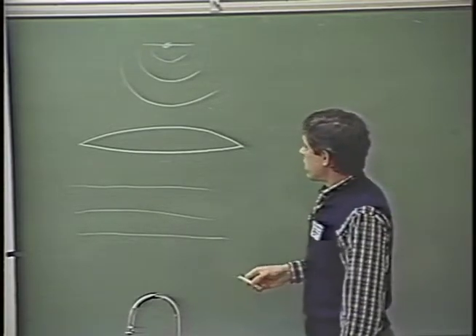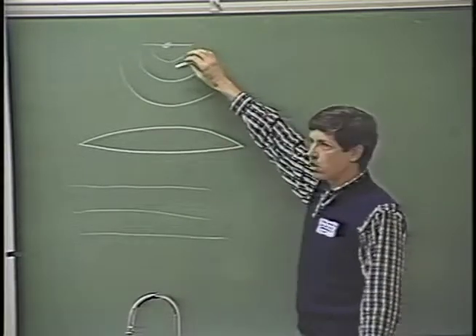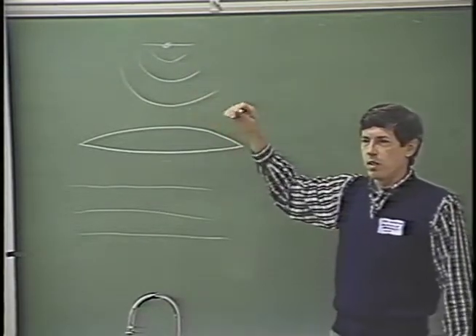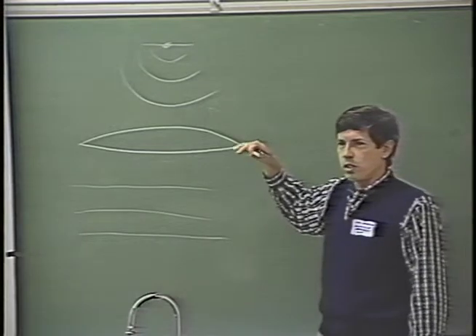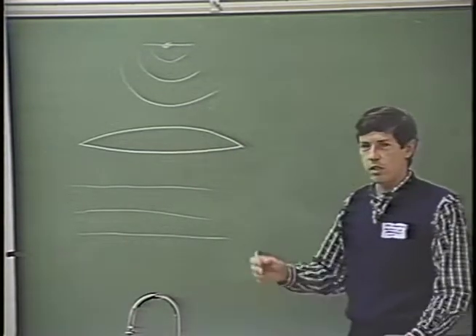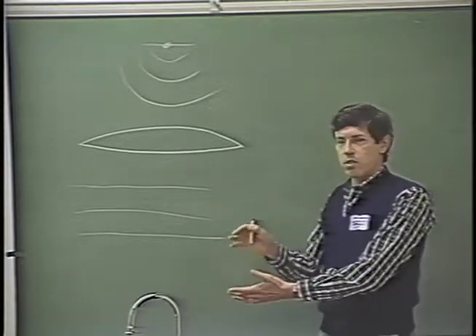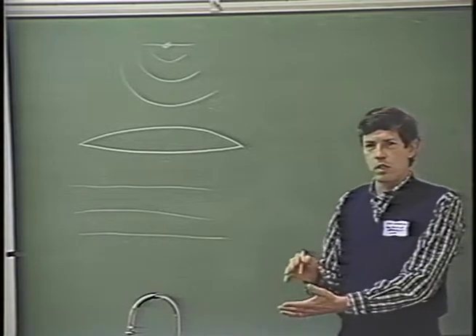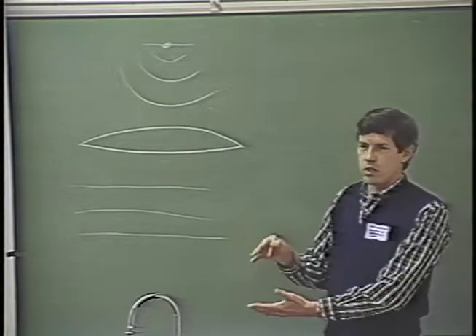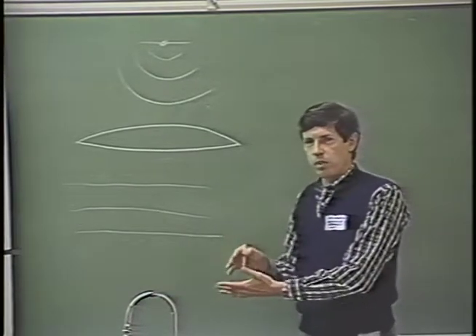Now the reason that happens has to do with the fact that these scattered waves are shifted in phase by a quarter wavelength with respect to the unscattered waves. The only influence of that is that when the interference occurs in the image plane, there's no constructive or destructive interference between the scattered and unscattered electrons, and that generates no contrast in the perfectly focused image.